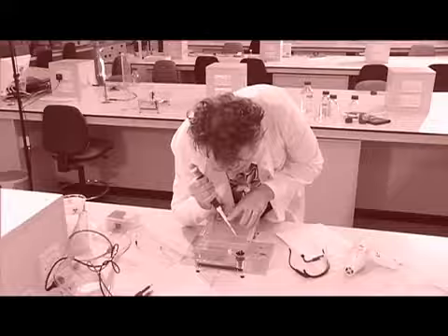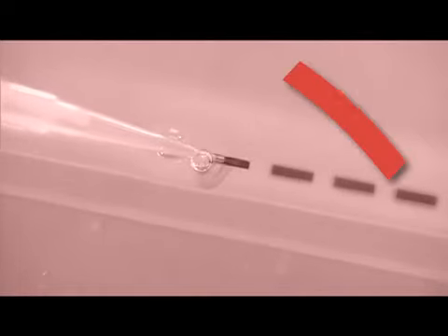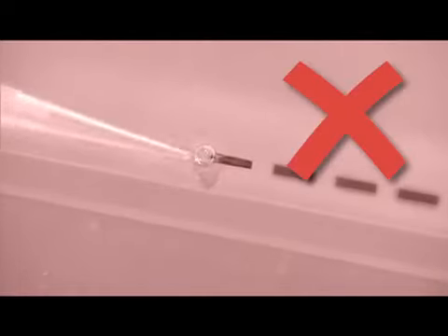Take care not to damage the wells when loading your samples. A damaged well can allow the sample to leak out and may cause contamination of other wells. It can also cause nucleic acid fragments to migrate unevenly. Make sure you don't load air into the wells along with your samples. Air can cause samples to be lost from the well into the buffer solution and can also cause contamination of neighbouring wells.